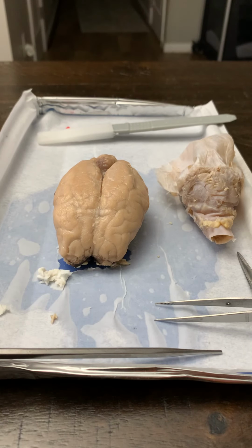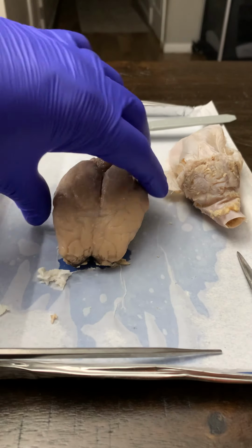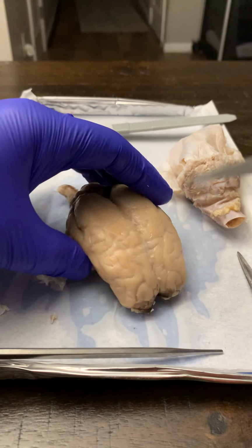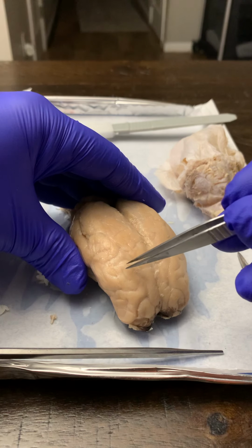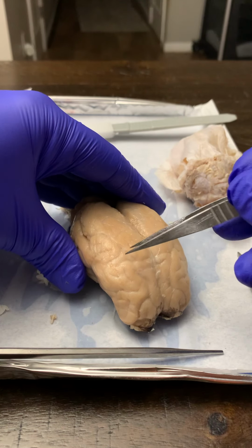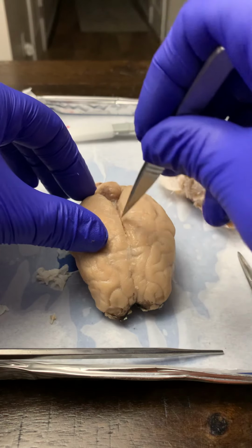Okay, so now that we dissected off the meninges here, we'll go into some of the exterior aspects of the brain. At first we're going to start with the cerebrum, which is going to be the largest portion of the brain here. Right here, these ridges, these kind of thick areas, those are going to be the gyrus. And then those lines in between, those little valleys, you can think of like a ridge and a valley. Those little valleys are going to be the sulcus. And then the longitudinal cerebral fissure is going to be this long valley down the center.